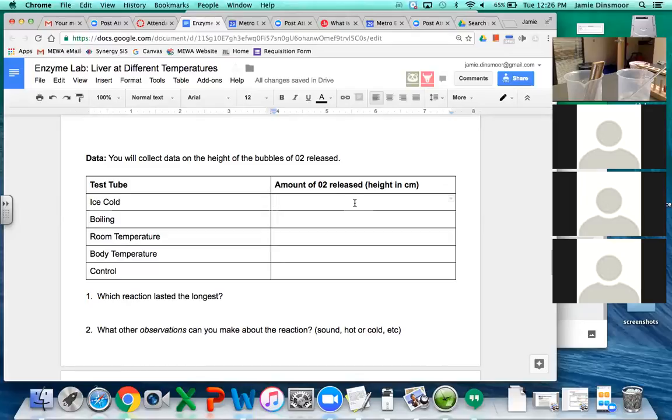Yes, we're very hot. All right, my thermometer people. Perfect spots. So I need one of you to put the thermometer in here. Try to hold it in there and not let it touch the bottom. When it gets close to 37, which it already is at, that's around body temperature.